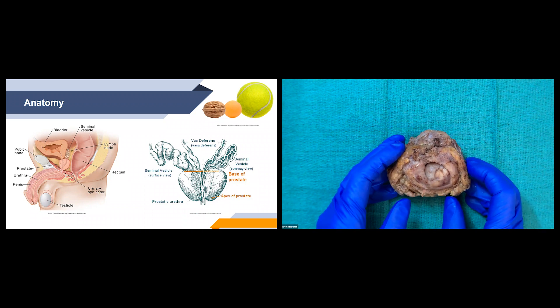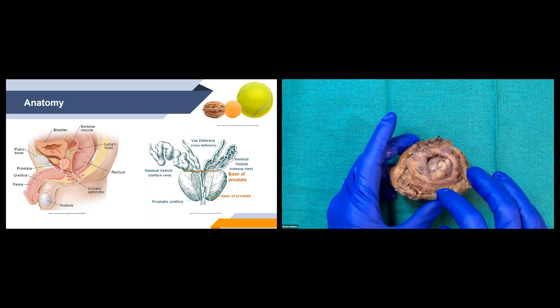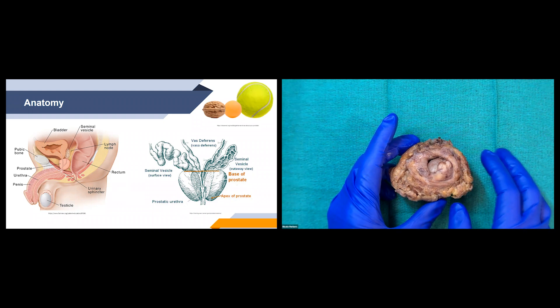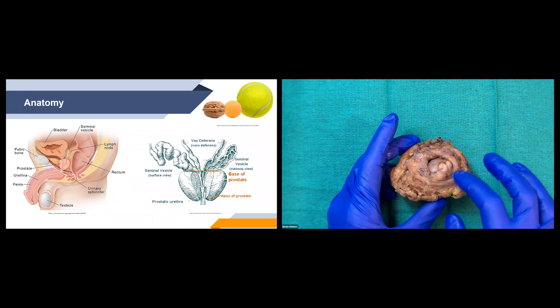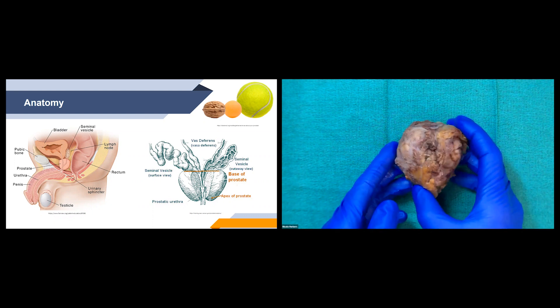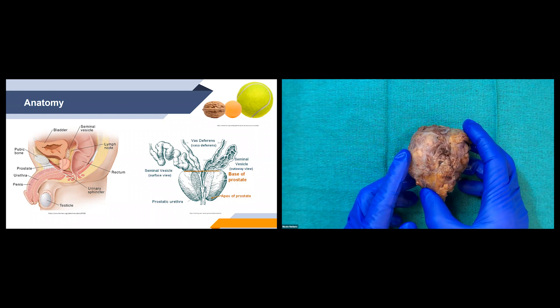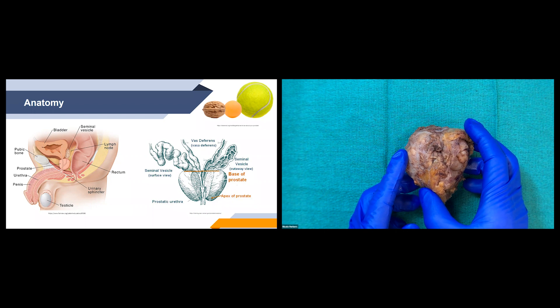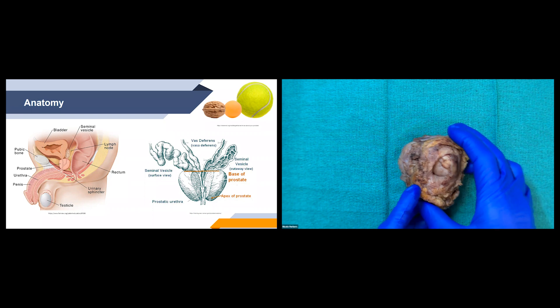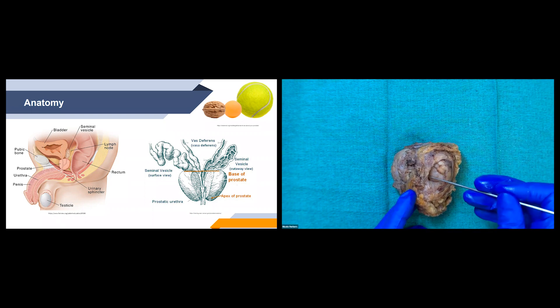Other important landmarks to identify on our prostate gland would be the base of the prostate, which is the most superior portion of the prostate gland and where the bladder would have sat. Directly opposite to the base is the apex, which is the most inferior portion. Running straight through the middle of the prostate gland is the prostatic urethra, which you can see here.